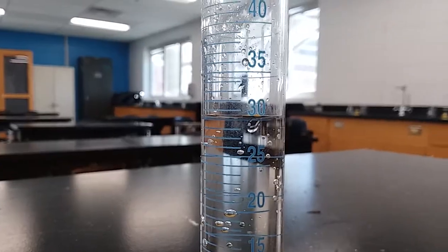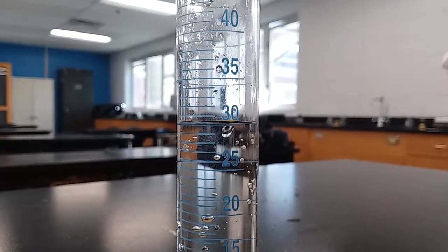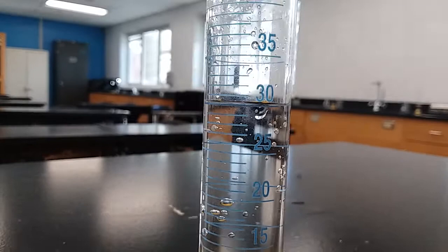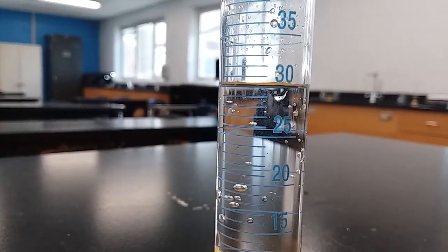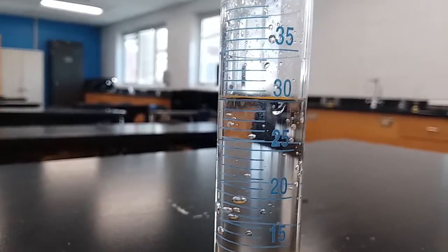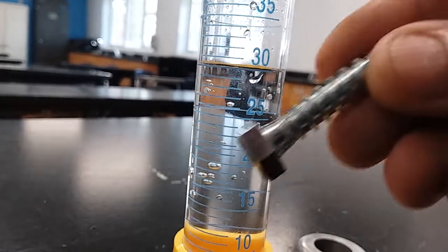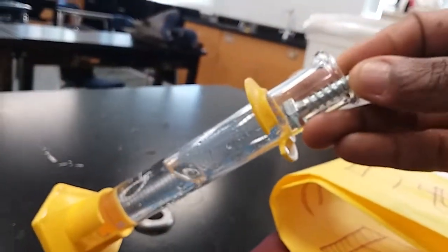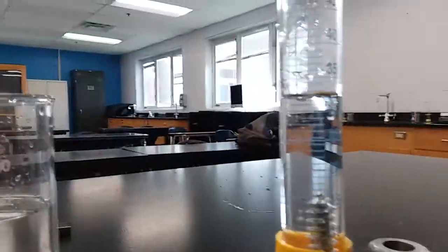Now we have 30 milliliters. See that? The blue line is right under the meniscus. I can even take out just a fraction more. There we go. 30 milliliters. I'm going to take my object, tilt it at an angle, and let it slide in. And now let's see what we got.